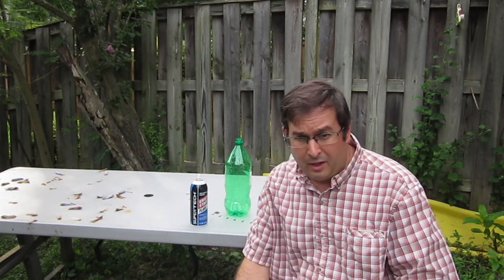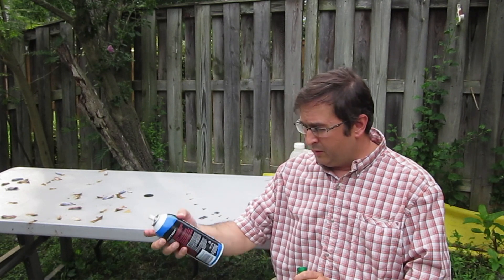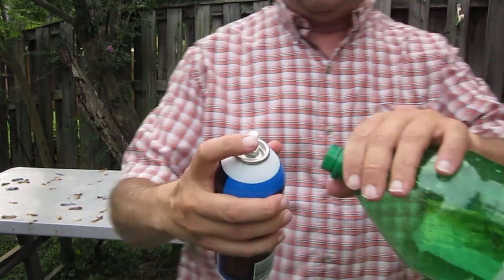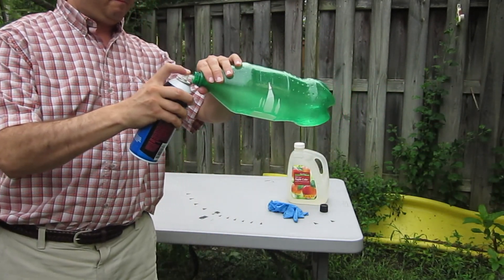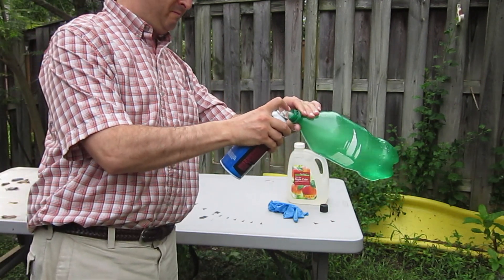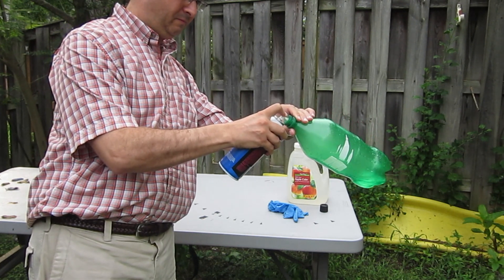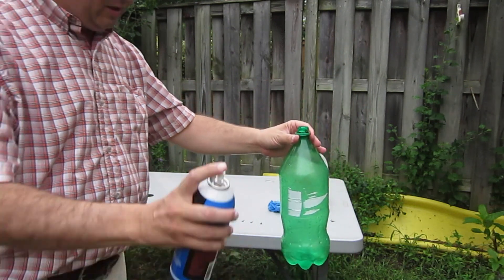Since diethyl ether is an anesthetic and I didn't feel like passing out and becoming unconscious inside, I decided to move my operation outside. So here's what we're going to do first — take our starter fluid and spray it into the pop bottle. This stuff is highly flammable, so don't be smoking when you do this.